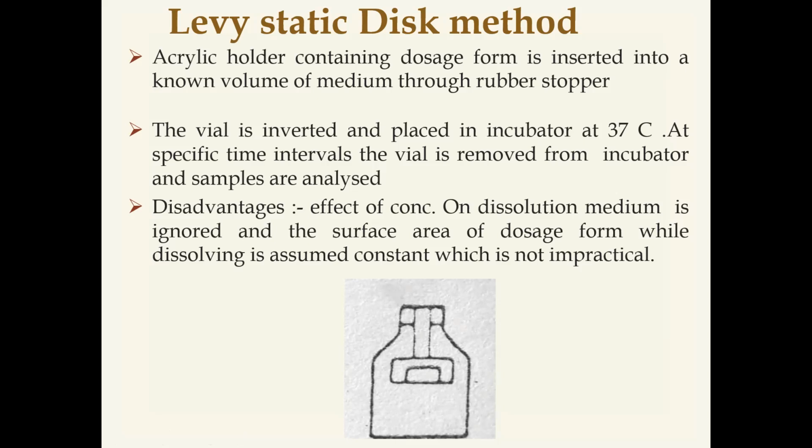After that, the vial is inverted and placed into the incubator at 37 degrees centigrade. After that, the vial is removed from the incubator, and the solution is analyzed at specific time intervals.